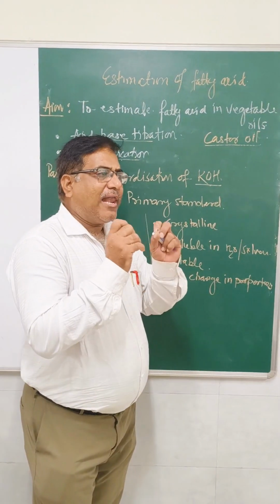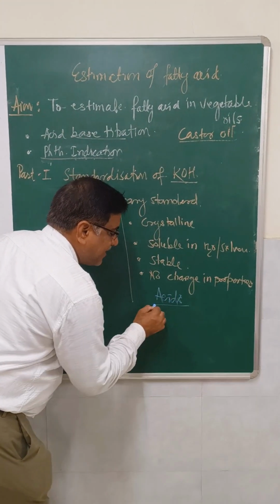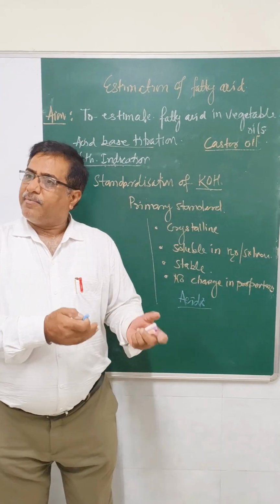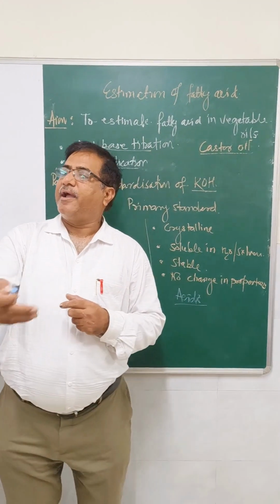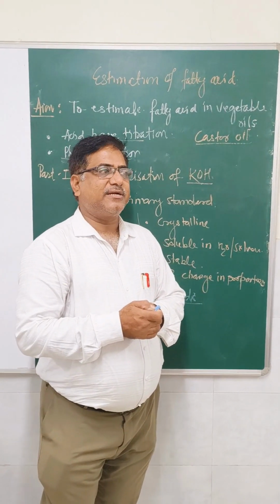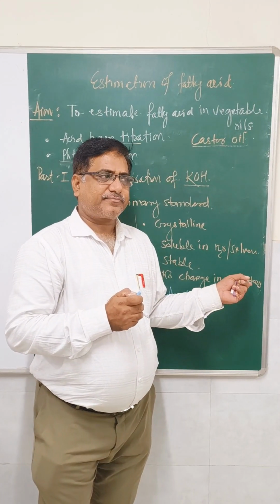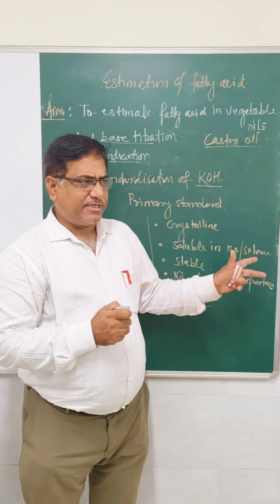For example, all acids, they are the primary standard. Organic acids like oxalic acid, succinic acid, benzoic acid are primary standards. Inorganic acids like HCl, nitric acid, sulfuric acid are primary standards. So all acids are primary standards, meaning they never change their normalities in the solutions. You can use it.